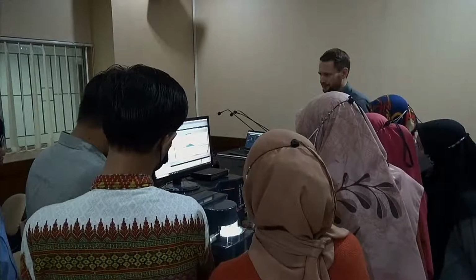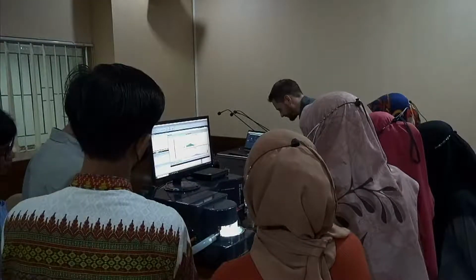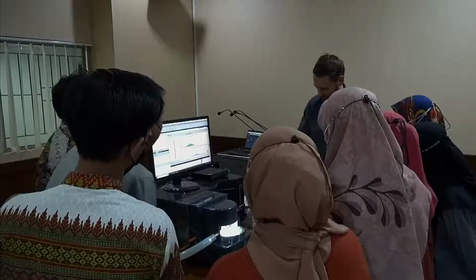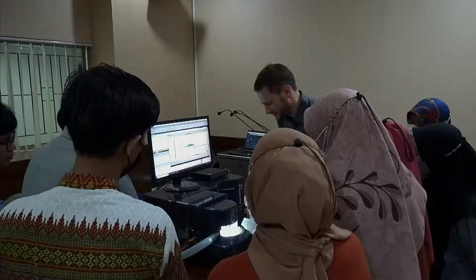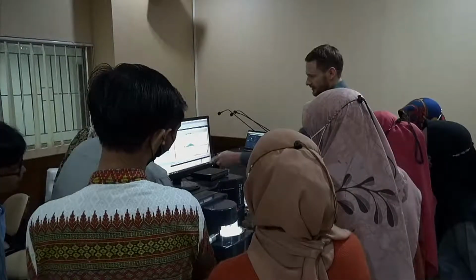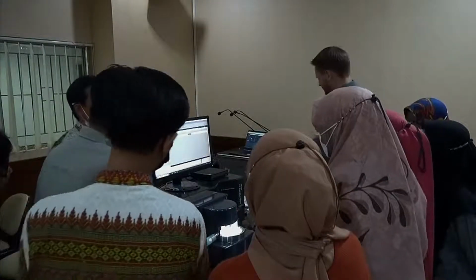Wait, let me find a way to put this. That's why you should shake it before use. If you take a pipette from the top or a pipette from the bottom, the result can be vastly different. There you see now I put too much of the coconut milk. So usually I would use the dilute button, which you see in the software right there, and then it will automatically dilute the dispersion. In this case, I can just manually add some water.